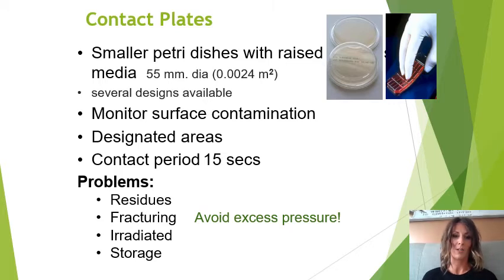Another problem with contact plates is they are very delicate, and if you press too hard, you rupture that agar surface. So do not press too hard, be very gentle. Just make sure you're adhering to the surface but not pressing too hard. They're also irradiated, so the plates come in irradiated packaging, and you need to store them the same way as I said with settle plates. They need to be at room temperature, agar face up and lids face down where you can.